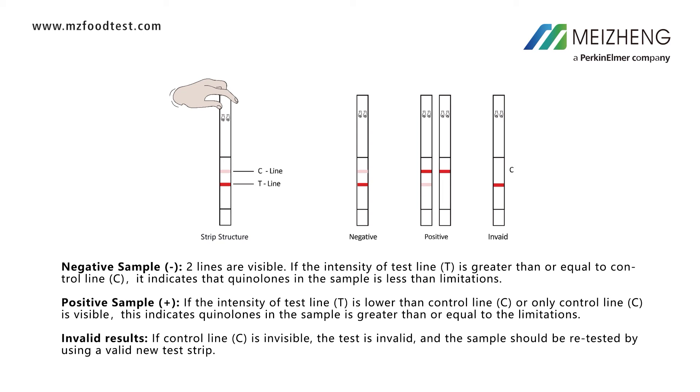Invalid results: if the control line is invisible, the test is invalid, and the sample should be retested using a valid new test strip.